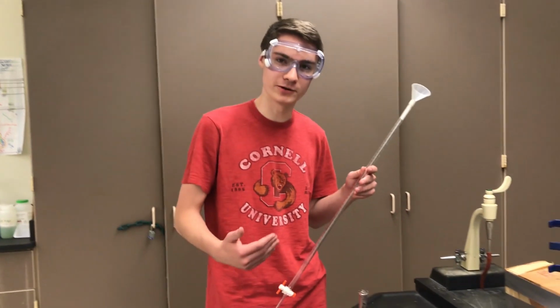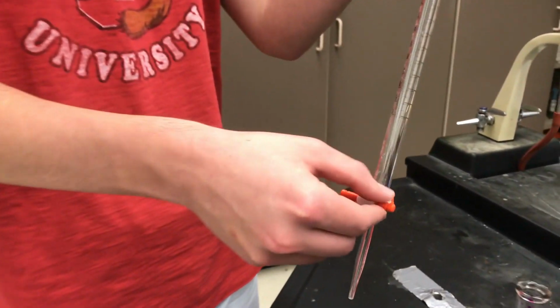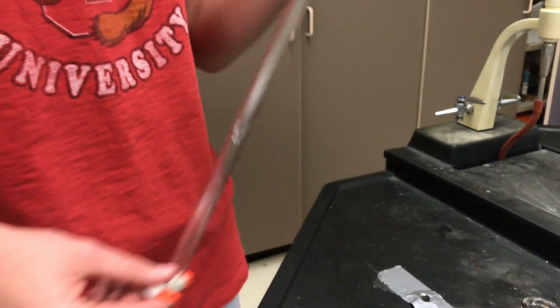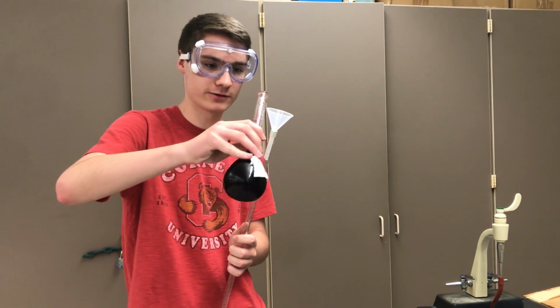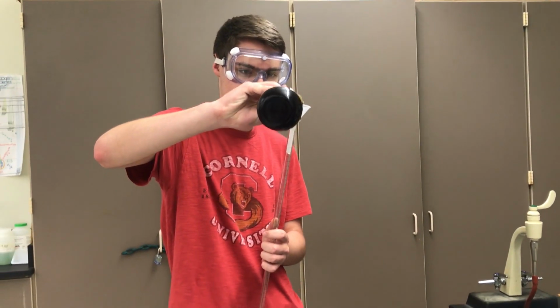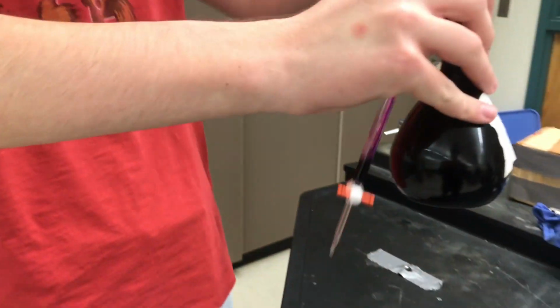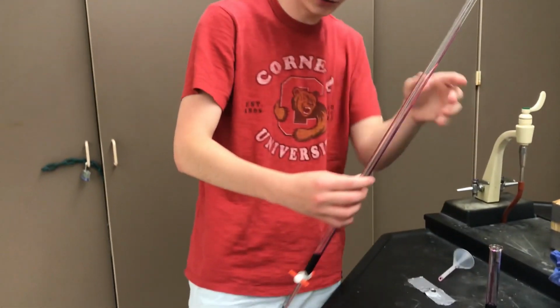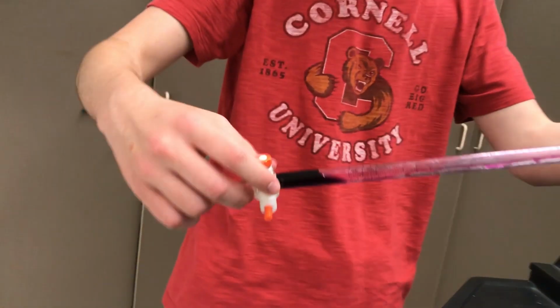First step in preparing our burette is to clean it. Before you do this, make sure the stopcock is closed. Now, we can add about 5 to 10 milliliters of our stock solution. Now, what we're going to do is swirl this solution to cover the entire surface area of the interior of the burette.